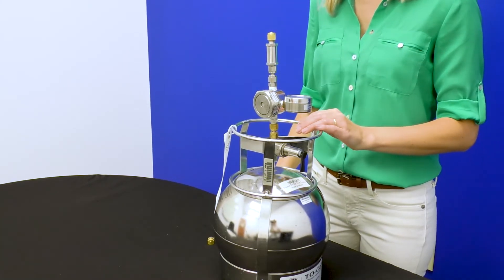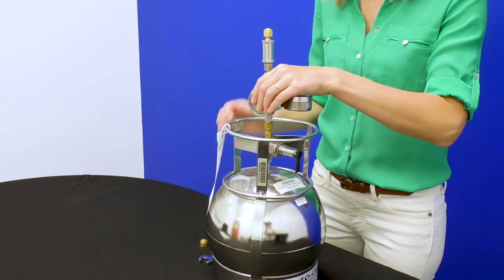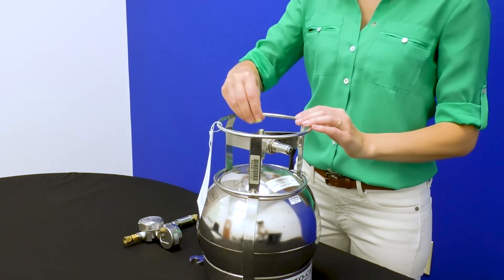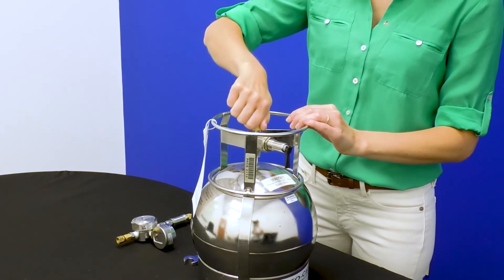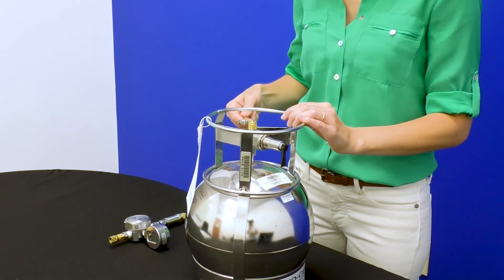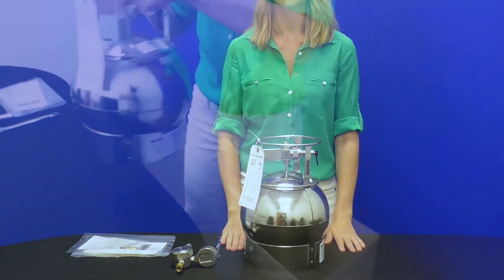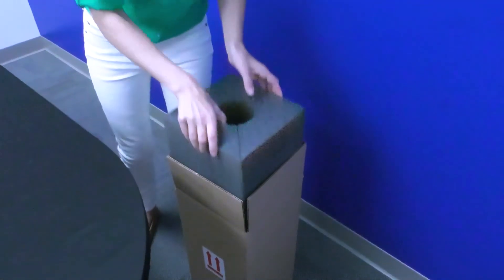Remove the regulator using the 9/16th inch wrench. Replace the brass cap on the can. Fill out the remaining information on the COC and canister tag, and place sample identification labels, if included, on the back of the canister tag. Pack the cans and regulators back into the box similar to the way you received them. They are now ready for return shipment to the lab.